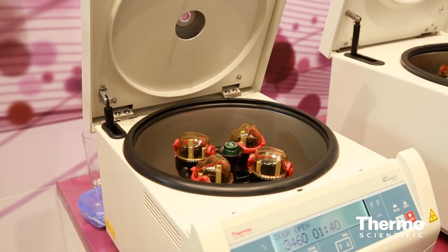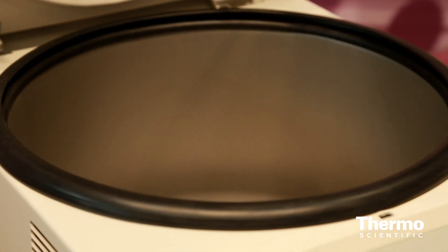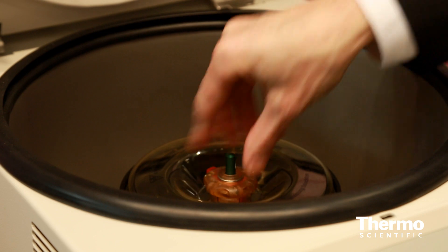The MicroClick 30 is really great for molecular biology customers. It's been specifically designed around the commercially available spin columns for DNA, RNA, and also protein molecular weight kits as well.